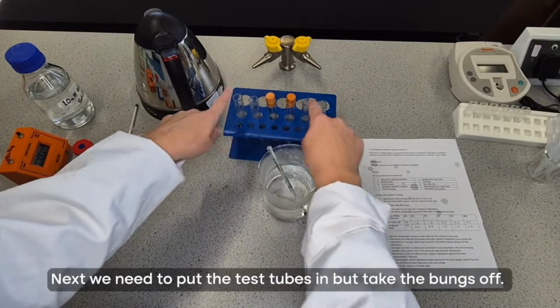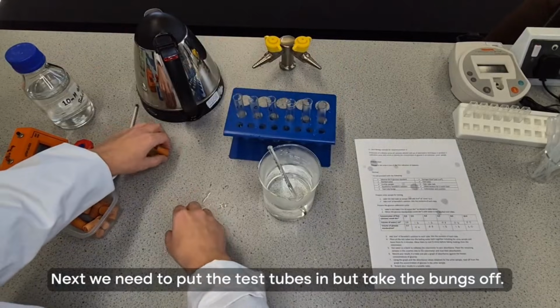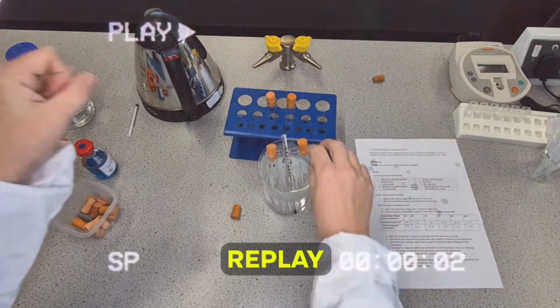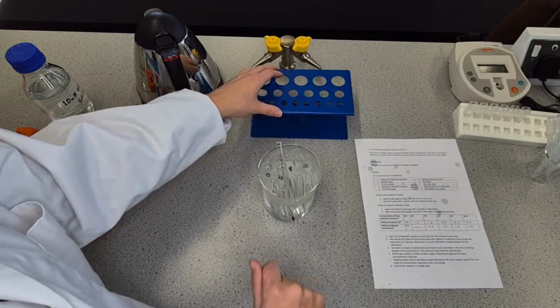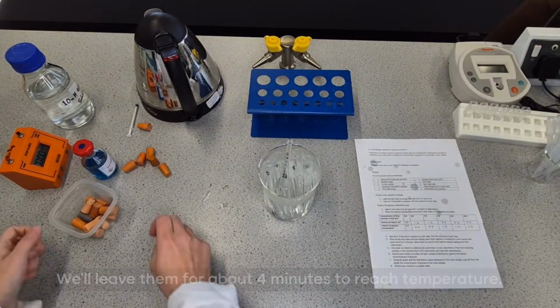So next then I'm going to put the test tubes in but take the bungs off because as they go into the hot water that can cause an increase in pressure in the test tubes and make them pop. Oof. Was not expecting that. And we'll leave them for about 4 minutes to reach temperature.